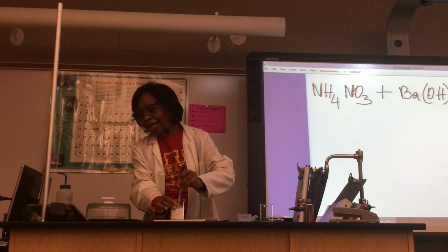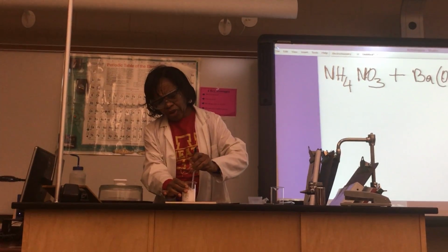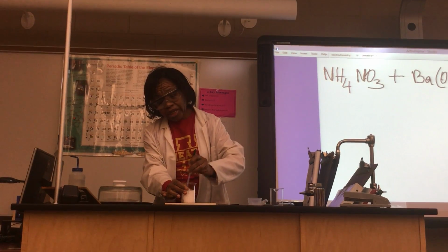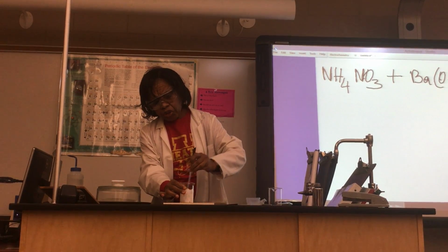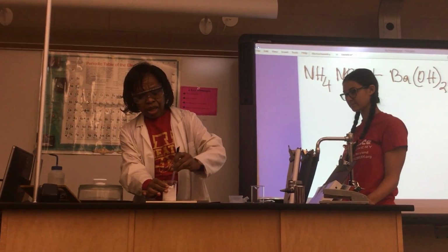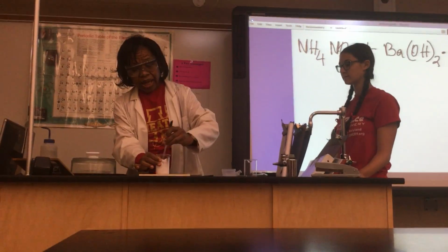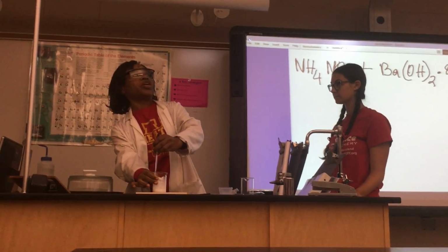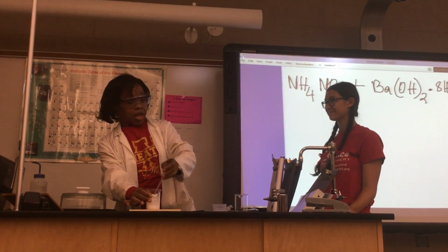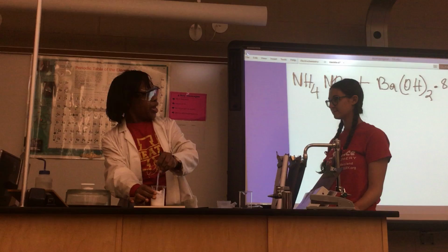So I'm going to ask, I start smelling something. So I'm going to ask a volunteer to come quickly here. You are going to do 2 things for me. You are going to touch the beaker to see what happened to the temperature. And I also need you not to get your nose too close, and waft it to see if you smell something.